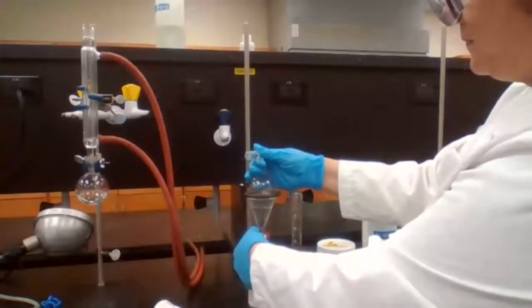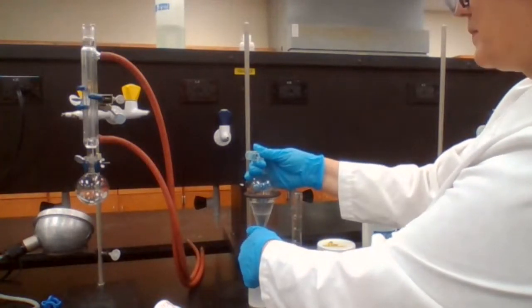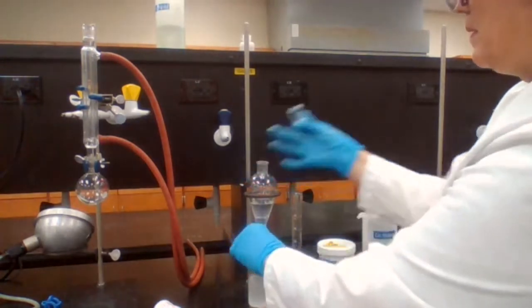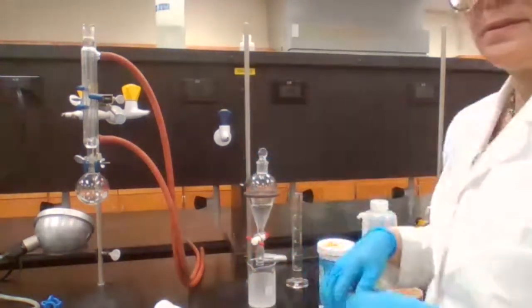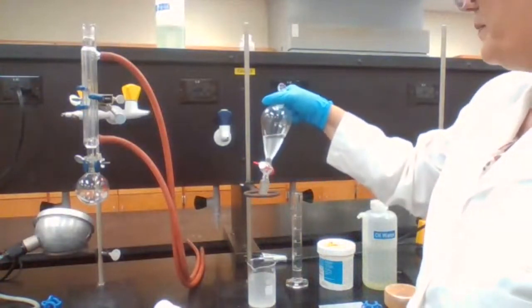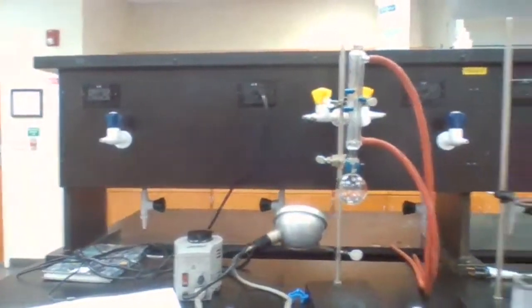We're going to drain the aqueous layer, make sure the cap is off. And next, sodium chloride solution. Wash with sodium chloride solution, yes? Okay.